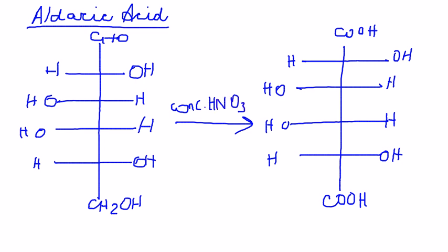So first things first, what do we know about galactose, the starting material? Galactose is a sugar. It's a reducing sugar. It's a diastereomer of glucose. So when you look at this molecule, something should click. One of those things is the presence of 4 chiral centers, and that means that 2 raised to the power of n, where n is the number of chiral centers, you have 16 diastereomers possible, one of which is glucose as well.